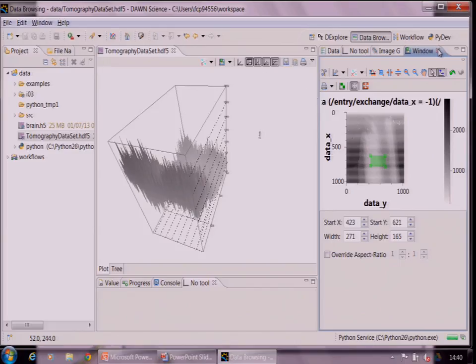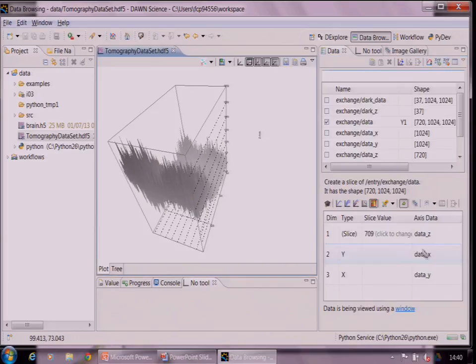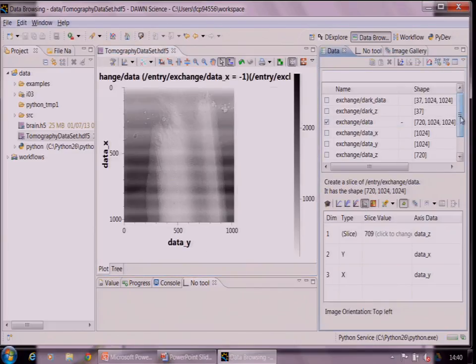And one really cool feature, which I'll show you, is the ability to write expressions which are only evaluated in a lazy way. It's easiest just to show you how it works. So I can do a rolling mean of an expression such as dark.